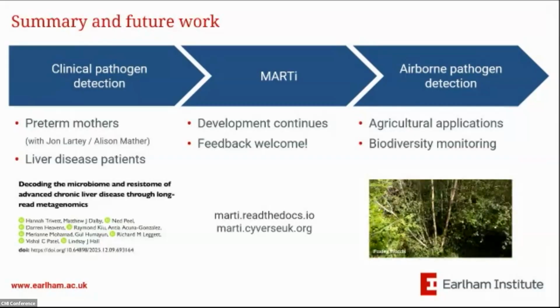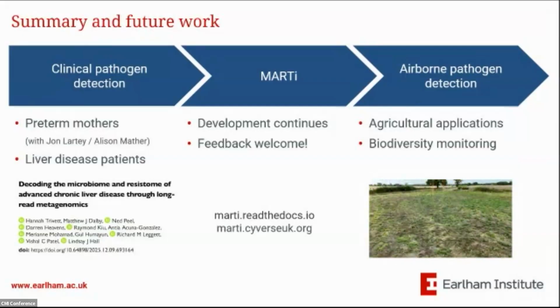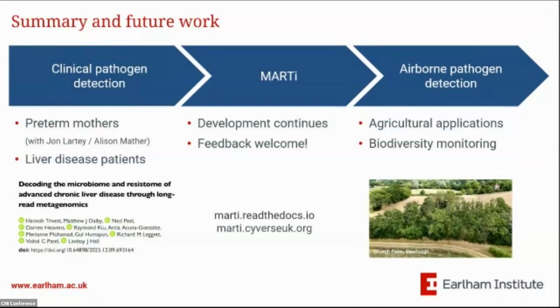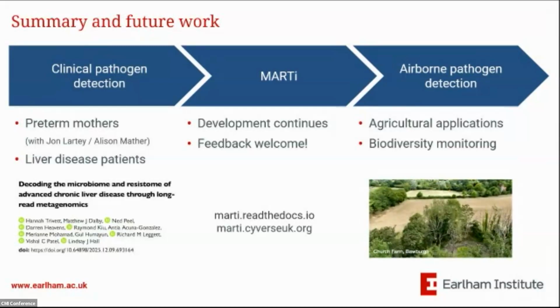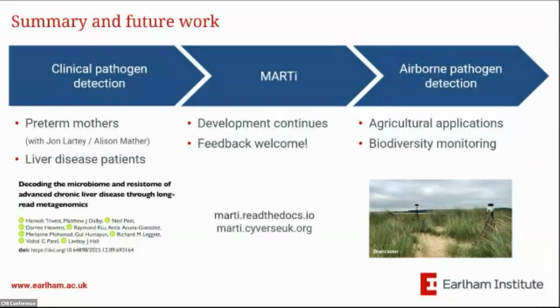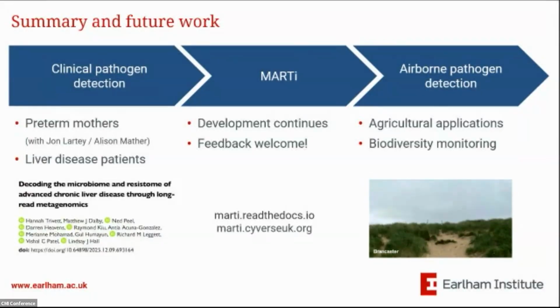We're also, with Lindsay, Lindsay led a project that we recently pre-printed using similar kinds of approaches in patients with chronic liver disease, gut-related complications. So that was recently pre-printed using these same nanopore approaches and using MARTI. And the development of MARTI continues. As I say, we'd really love to hear from any users, potential users.